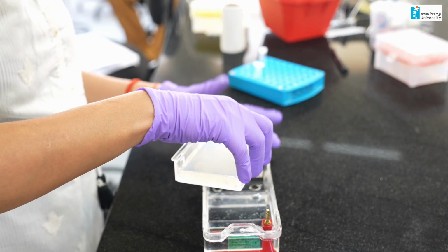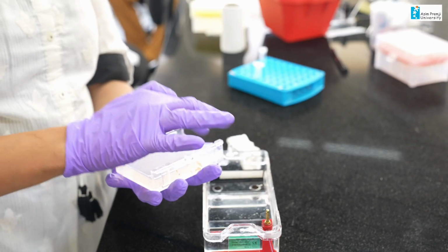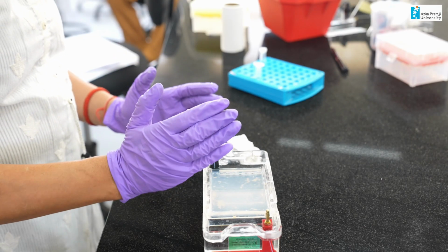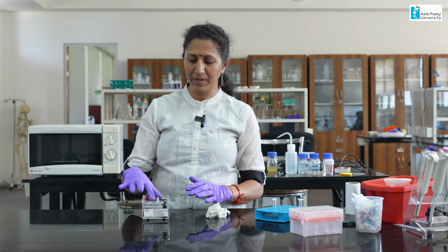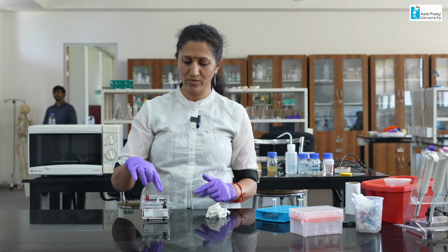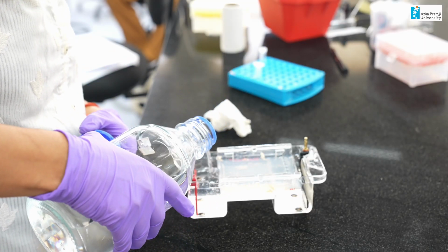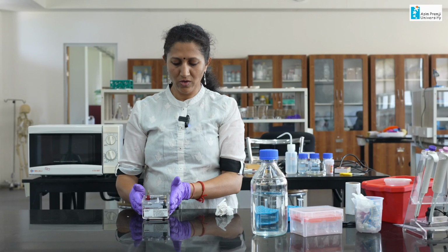When you keep it inside the tank, you should be very careful that the side with the wells should be towards the negative electrode, because DNA is negatively charged. When you run this gel, the DNA starts moving towards the positive end. So, loading should always be on the negative side. Once I place it, I have to fill the tank again. If the gel is not completely immersed in 1x TAE buffer, I have to pour a little more buffer. Now, your gel is ready to load the DNA sample.